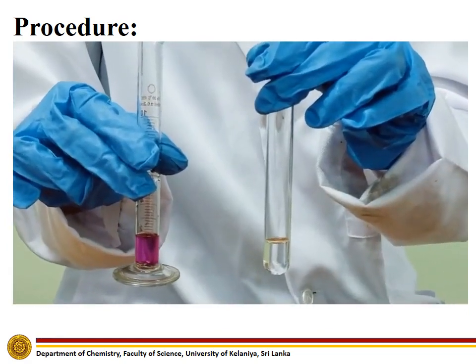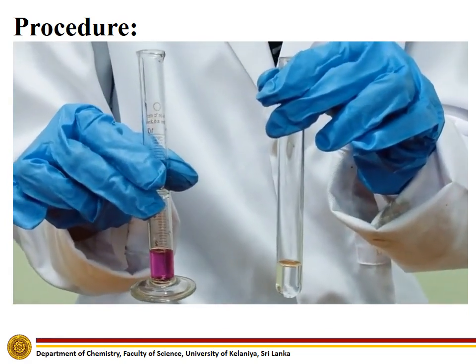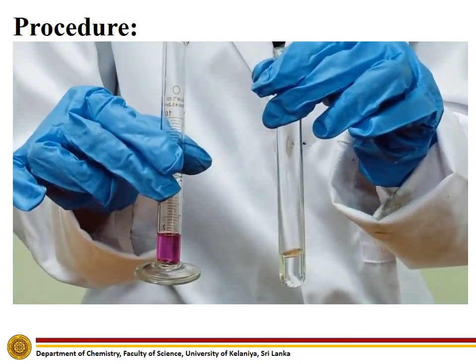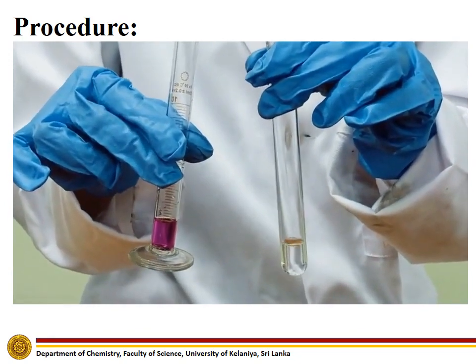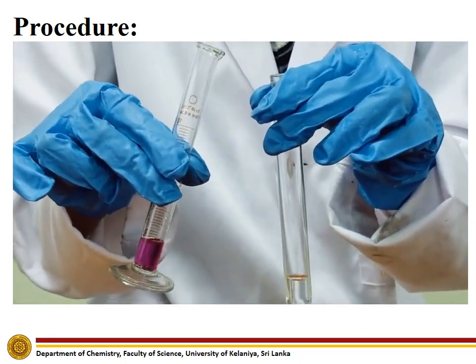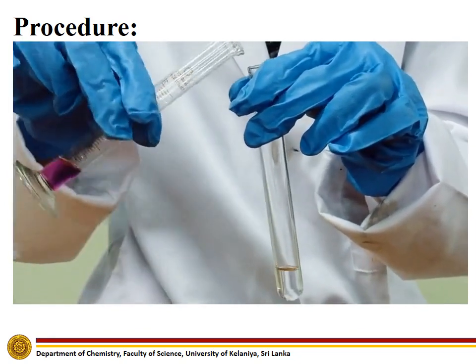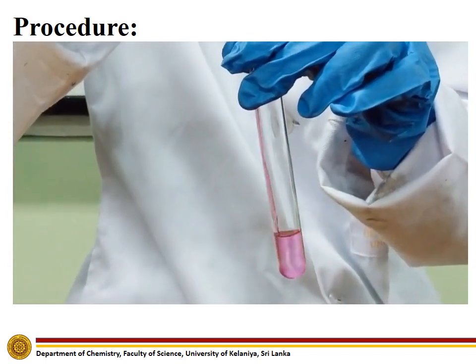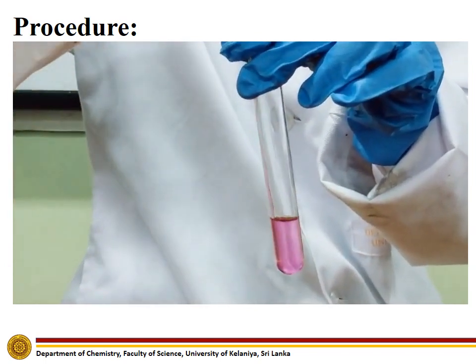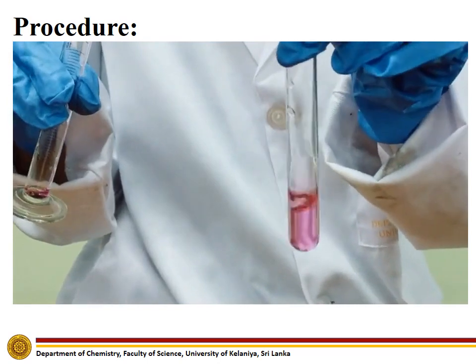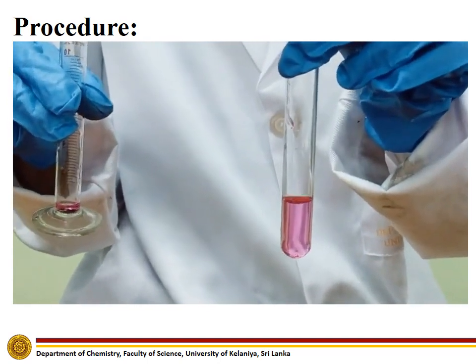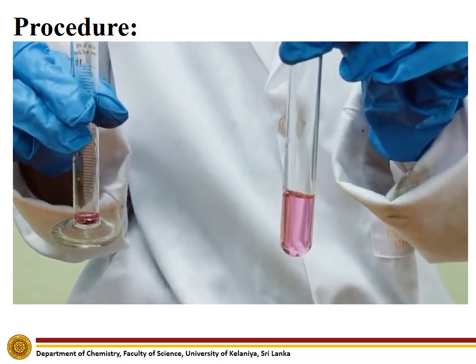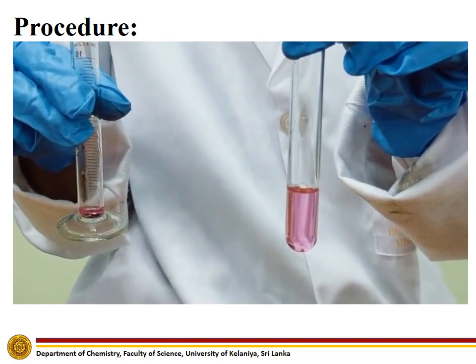To carry out the fifth experiment, add acidified potassium permanganate and observe whether a color change occurs. No color change is observed.